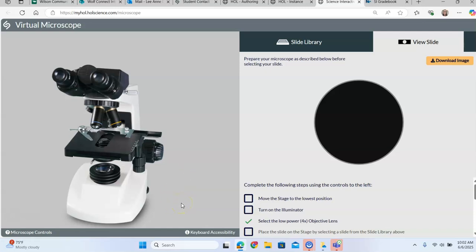All right, I have recorded 15 minutes of this video, and I am so sorry. I'm trying to figure it out, but I'm trying to record it for you too, and I'm going to stop here because that's going to be too much for you to watch. But I'm hoping this is the problem, is that the first two steps weren't done.